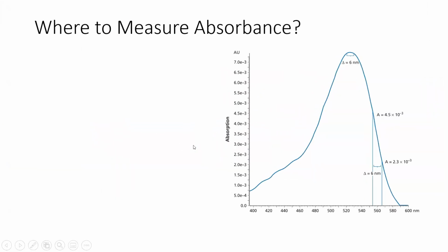So when we're taking our measurement, where do we measure, right? We always talk about lambda max is the best point to measure, but why do we measure lambda max? This chart is an image from our textbook. It shows sort of the real reason why we do it. If we look at the lambda max here, our absorbance is constant across the range. Whereas if we look at that same bandwidth in a different region, our absorbance changes by a whole heck of a lot, right?